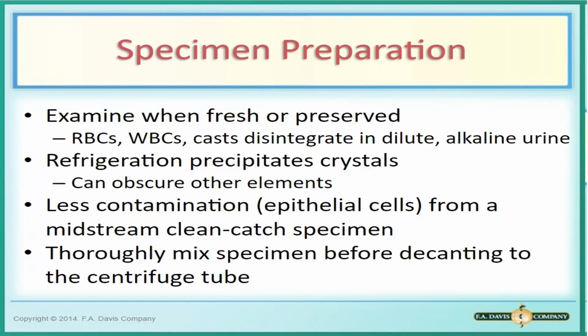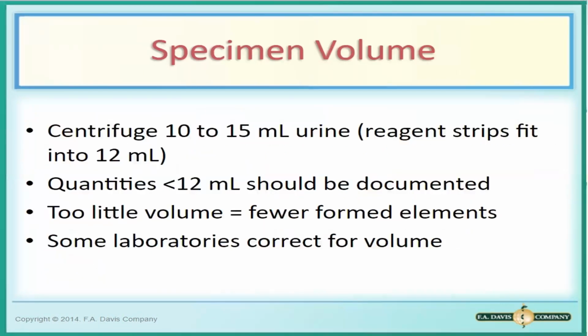Okay. So for this specimen preparation, I believe you already know this kasi alam ko urinalysis na kayo sa laboratory. So let's just move dun sa mga nandun sa handouts ninyo. Specimen standardization, specimen preparation. Make sure na properly mix ang sample before nyo i-transfer sa inyong tube, para equally distributed ang sediments.